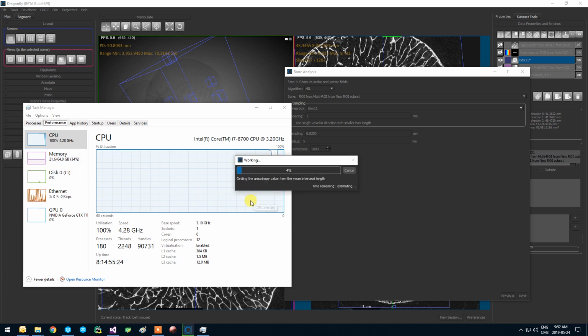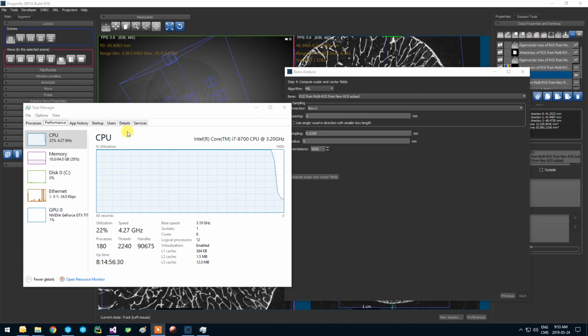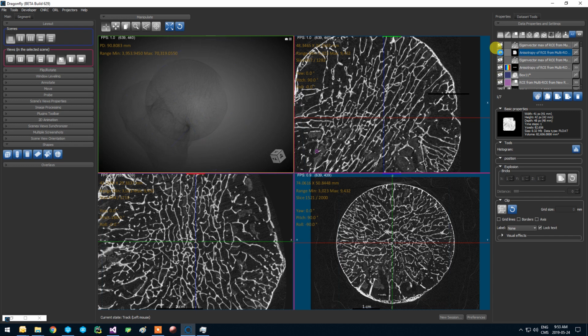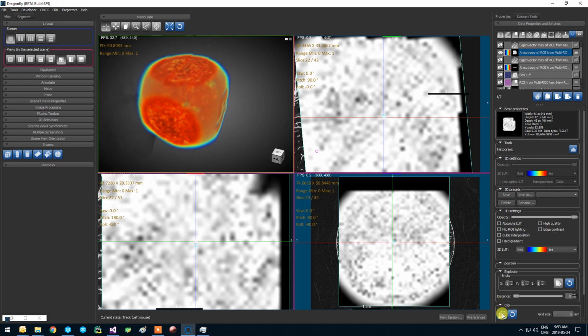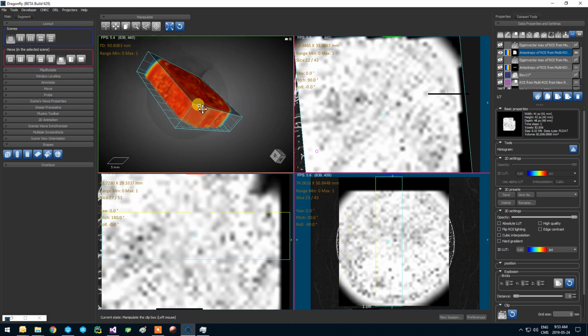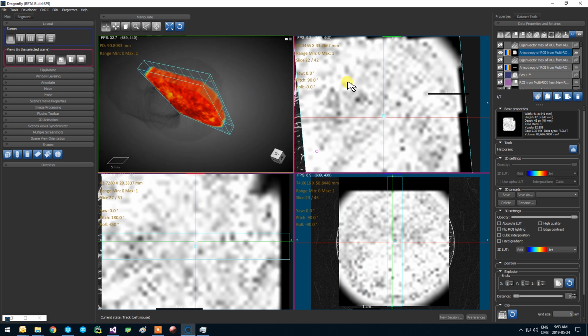Okay. Second part, this one is quite fast. Now these two values have been produced. So I will hide the box. The anisotropy mapping is now computed in 3D. I will put it in jet. It's not very possible to look at it just like this, so I will use the clip, to get approximately the same result I had in 2D, by the way.